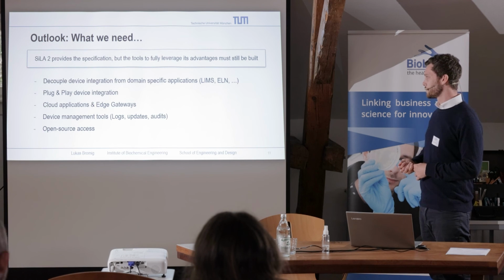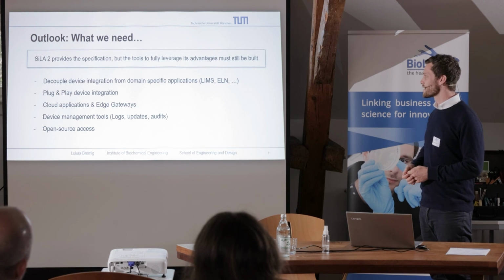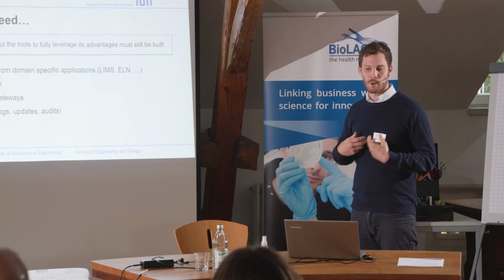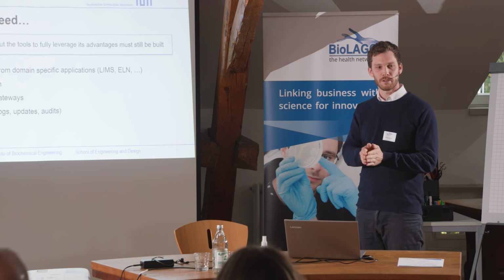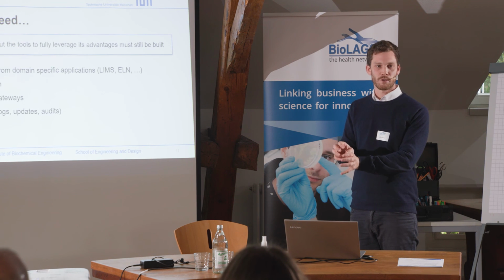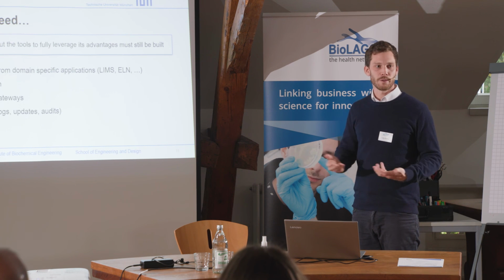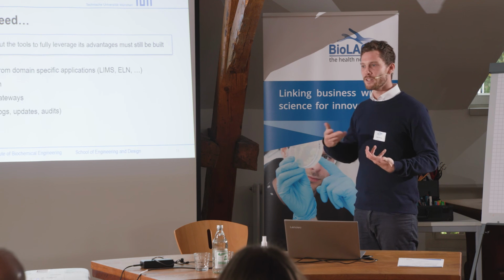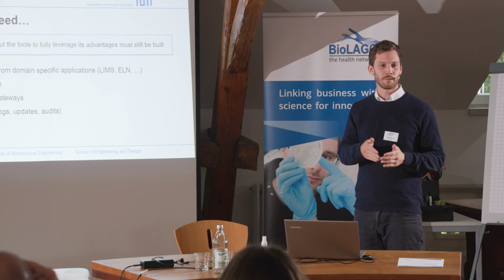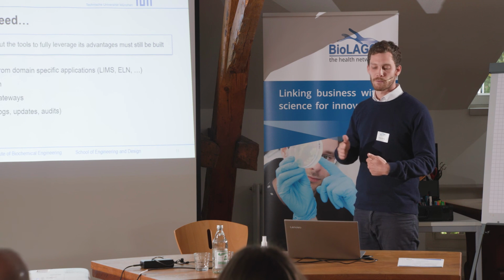And on top of that, since we're a university, we always need open access, open source access. That's pretty important for us. But the biggest takeaway for us was that, at least from our perspective, if you want to stay flexible, you have to decouple your digital infrastructure from your specific software like your LIMSs or your ELNs, because if you always make custom integrations into those, then you're going to do those integrations over and over again. Ideally, if everybody supported SiLA, that wouldn't be the case anymore, because you could do those integrations quickly, but at the moment it's not fully there yet, so we run this approach.